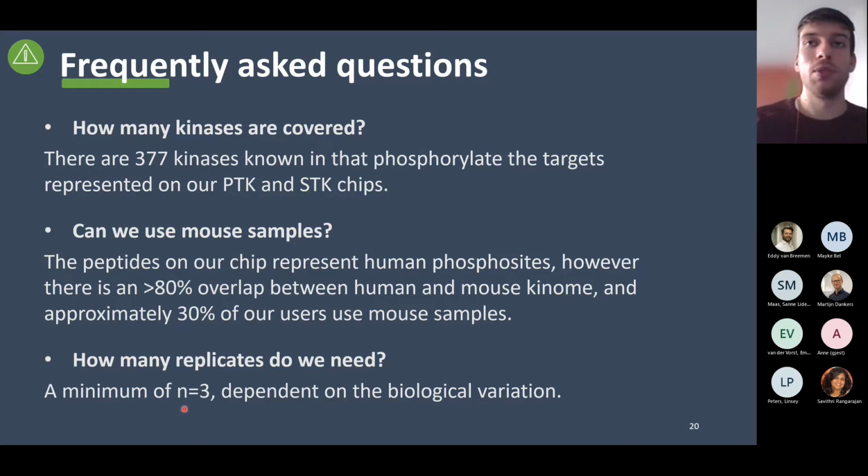If you're using human samples, so really clinical samples, for instance, because the variation is much larger, we would suggest a minimum of 10 samples per group, just to make sure that you can have the most appropriate statistical analysis. There are some cases where you can use fewer replicas, but we don't really suggest it. More replicas is always better, of course, but you will need to run more samples in that case.